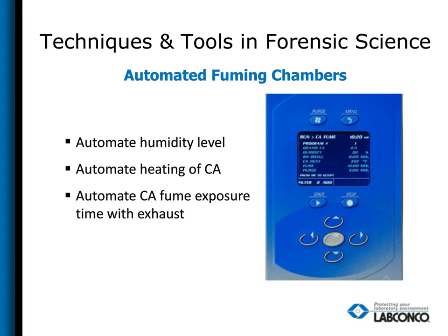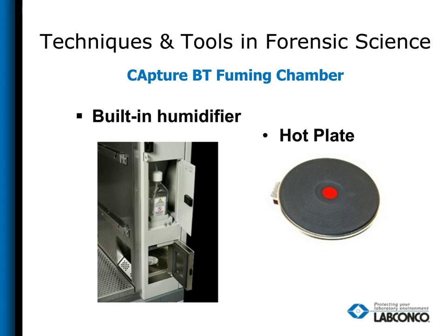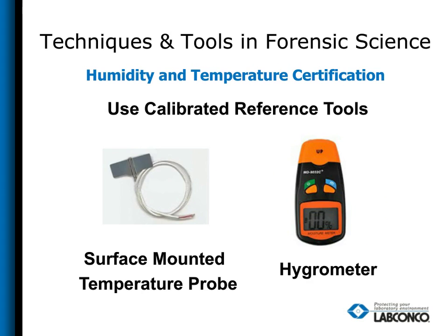With automated, you need to be able to get inside and actually verify your built-in humidifier and your hot plate with a surface temperature probe or hygrometer. This is important also for the labs that are ISO 17025 and 20 for your performance checking for your evidence processing.